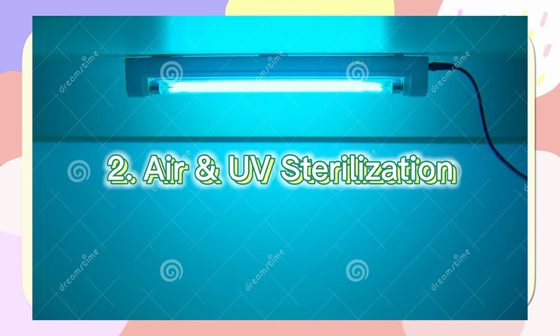It is a carefully enclosed bench designed to prevent contamination of biological samples or any particle-sensitive material. Laminar air flow does sterilization by using ultraviolet light. Air is drawn through HEPA filter and blown in a very smooth laminar air flow toward the user.